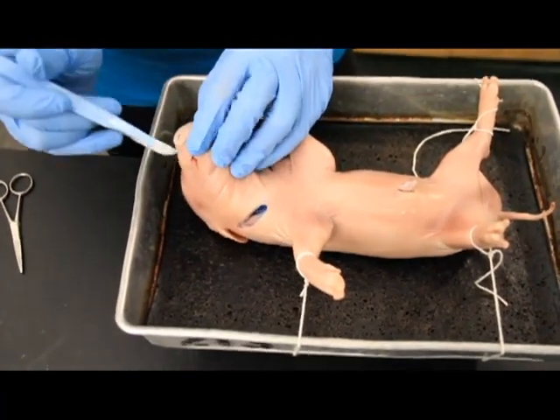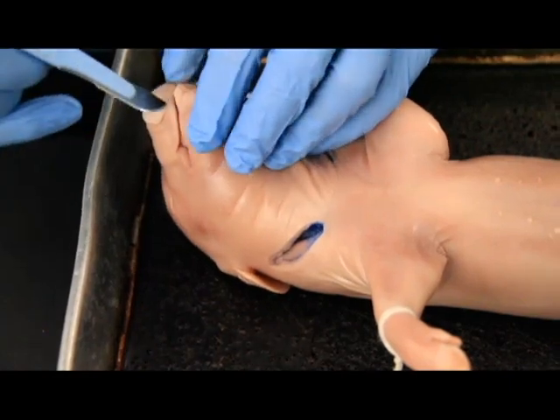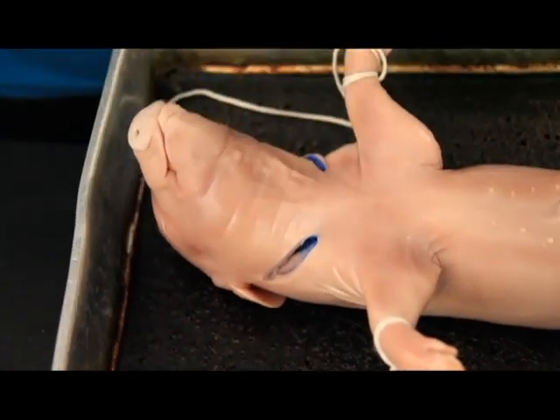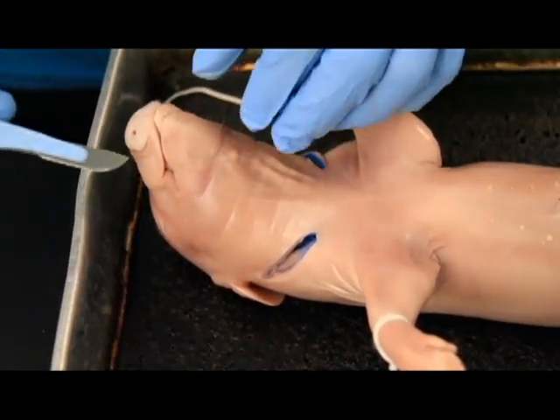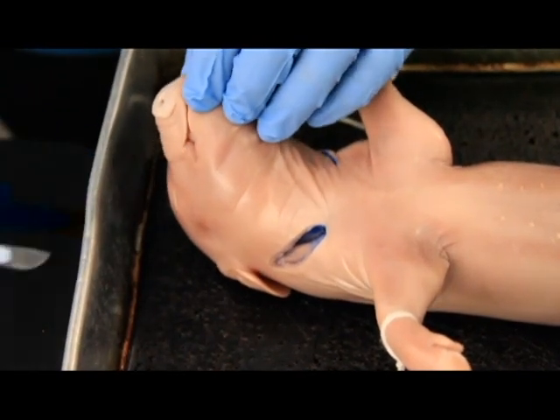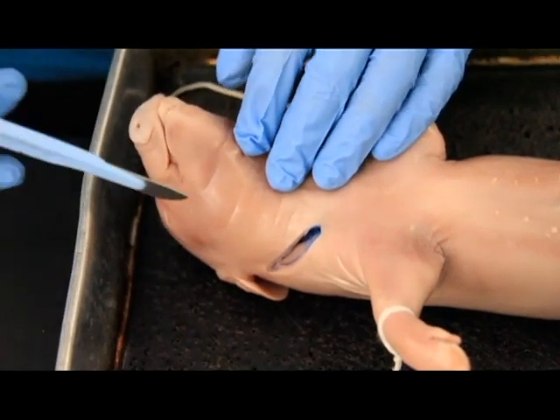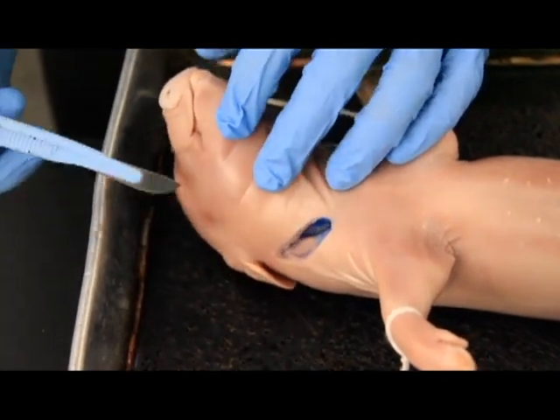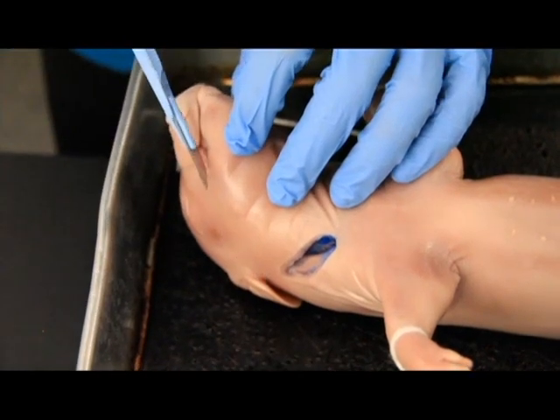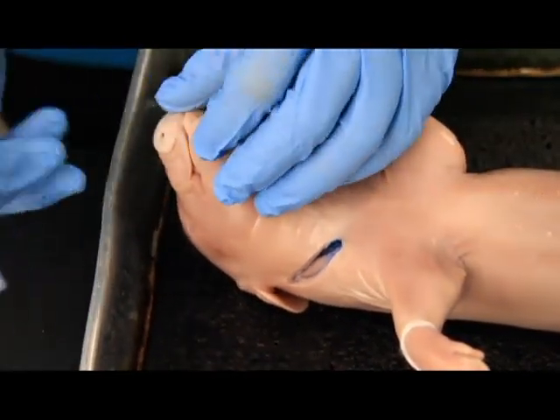So when you are cutting down here and into these jaw bones, what you want to do is you want to follow the tongue down, as if you were a piece of food. You want to get down into the throat. Not into the head necessarily, but definitely into the throat. And at this point you should have taken all the pictures of your cheek dissection already, any pictures and videos that you want, because a lot of the times the students will cut right through this very delicate area. So you want to make sure that you have everything done before you move on.